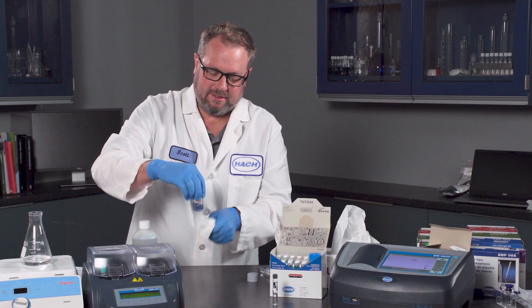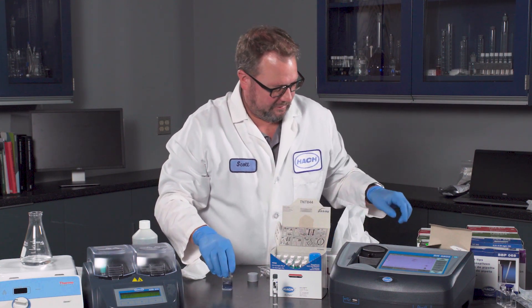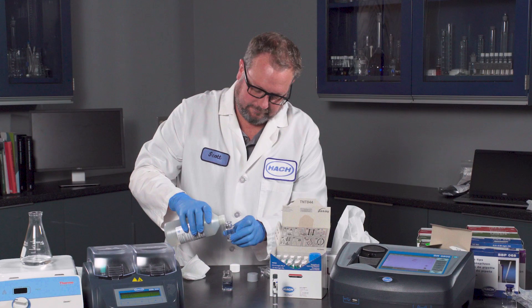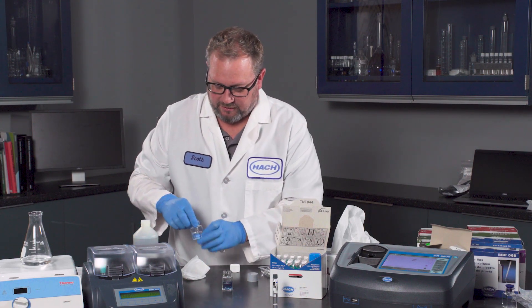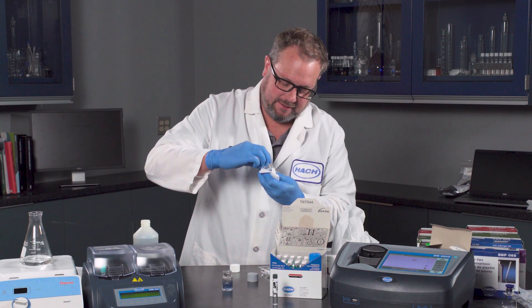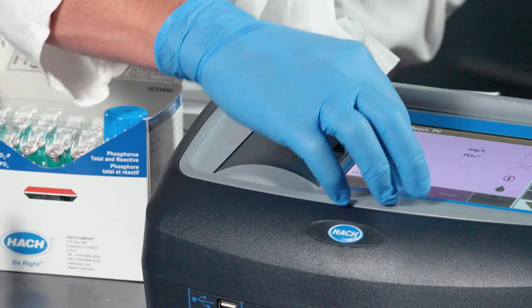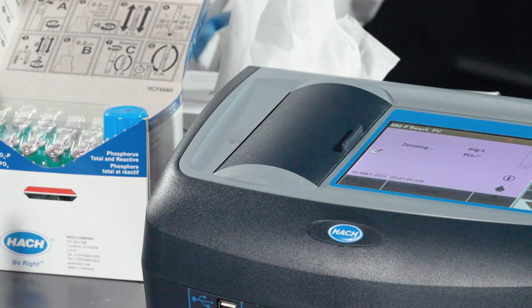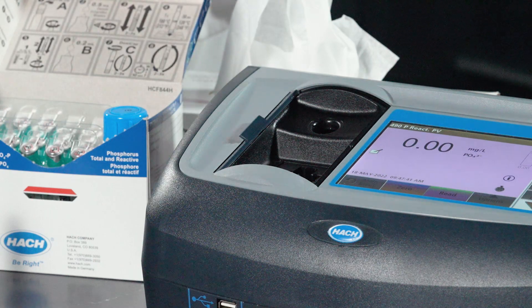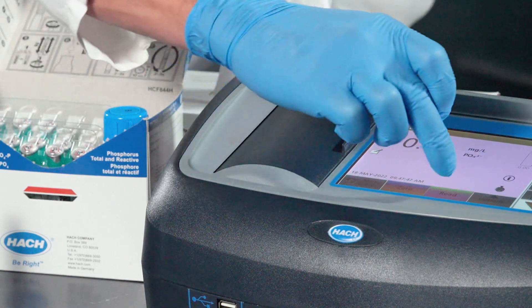The molybdate chemistry is very reactive. The other nice thing about the TNT Plus is you don't have to use blanking. Place this in, close it off, and then make sure it's all mixed up, cleaned off, place it in and read.